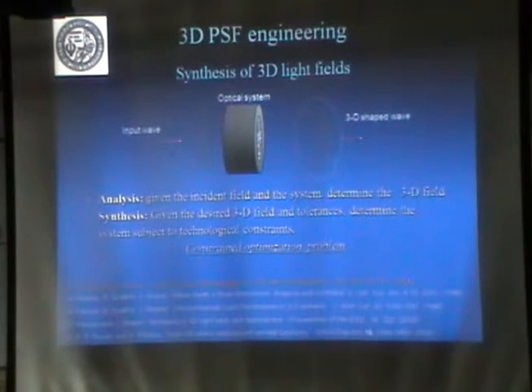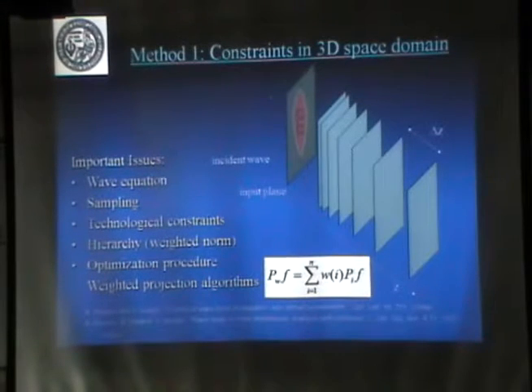So we try to find this lens. I didn't talk about this yesterday. So one way of looking, you have your hologram or your bad lens here, and you want to select a region where you focus, where you are going to generate these patterns.